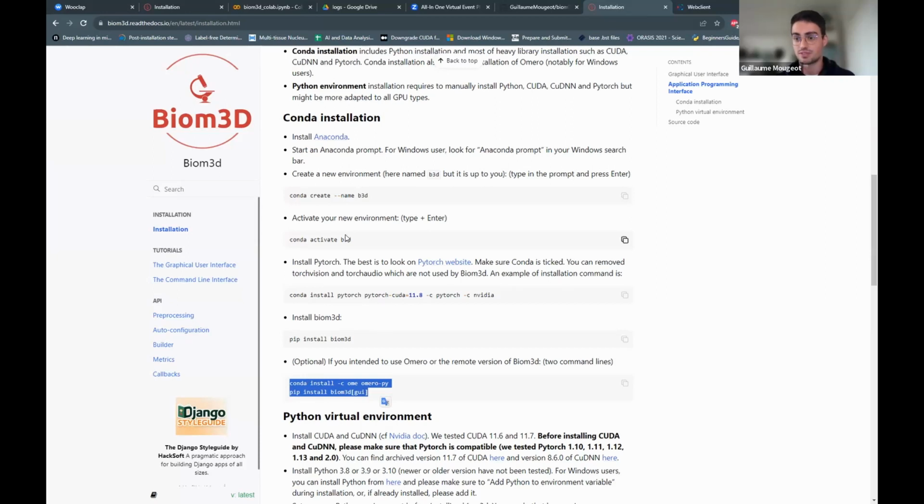It works on different images, even on membranes, a bit more complicated stuff. If you try and it doesn't work, we will be very curious to hear from you. So don't hesitate to give me feedback, and I can improve the software. That's how I include all the cases that exist in nature.